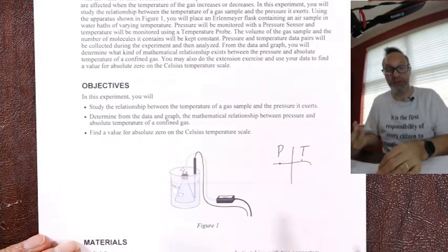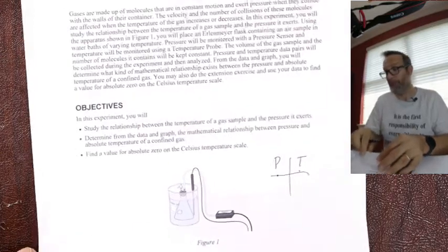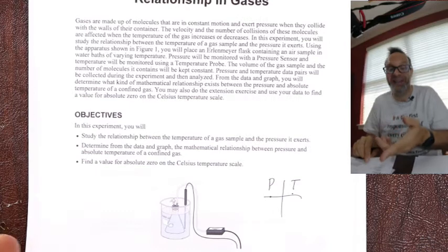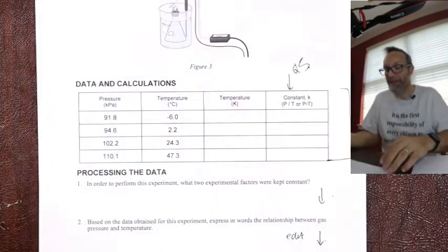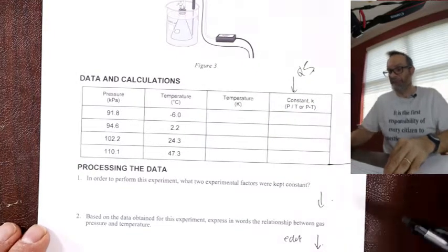Well, if you've seen the video, of course, as temperature goes up, the speed of the molecules increases, so they hit the walls with more force, the pressure should go up. So it's a proportional relationship. I think I just didn't give anything away, but that's one of the questions. Okay, so there it is. Now, careful as you fill this out.